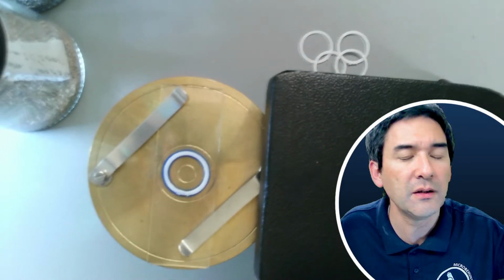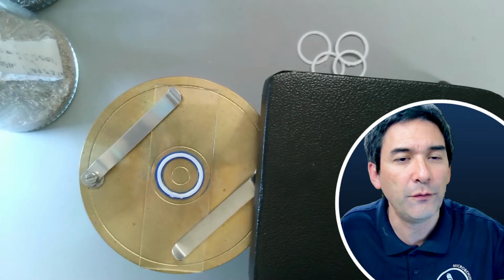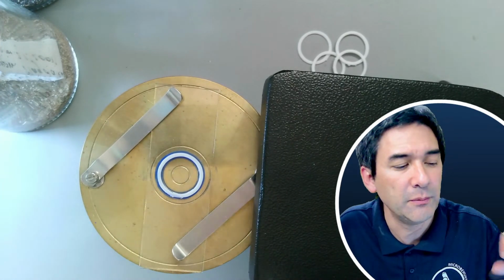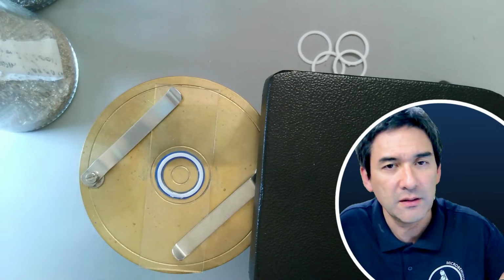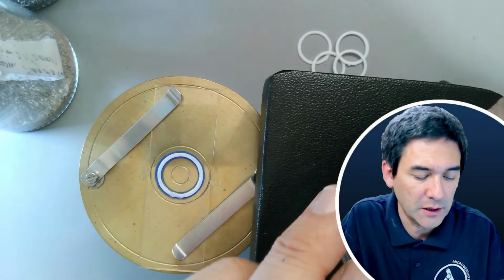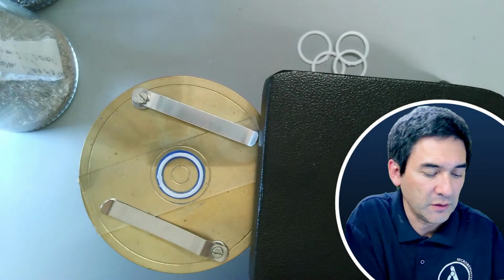What I've got here does not appear to be in focus. Just a second. By pressing this here, this is autofocus. The camera that I'm using now is different than the one before, because this one is actually for taking pictures of paper documents. Here I've got my round cover glasses this time, and I would like to glue some round cover glasses here on top.